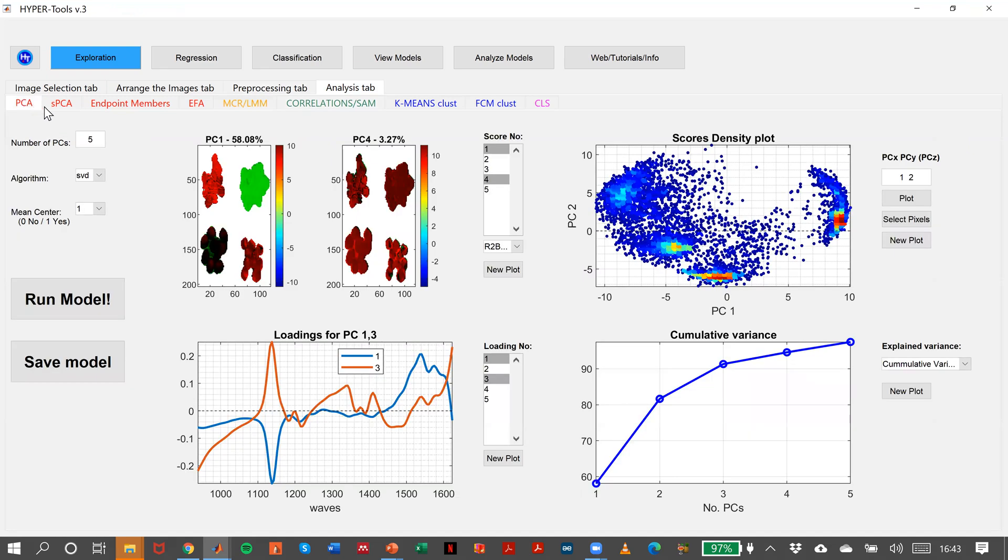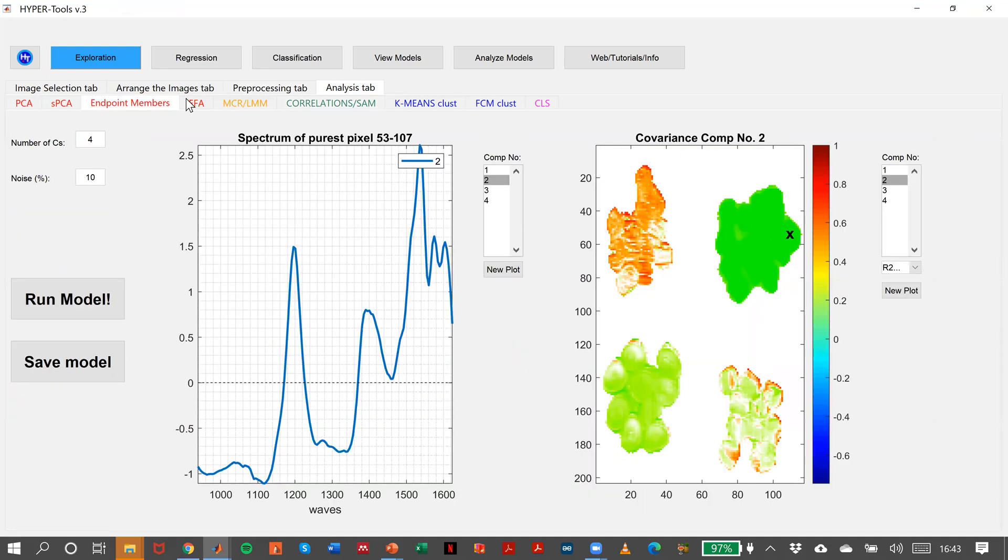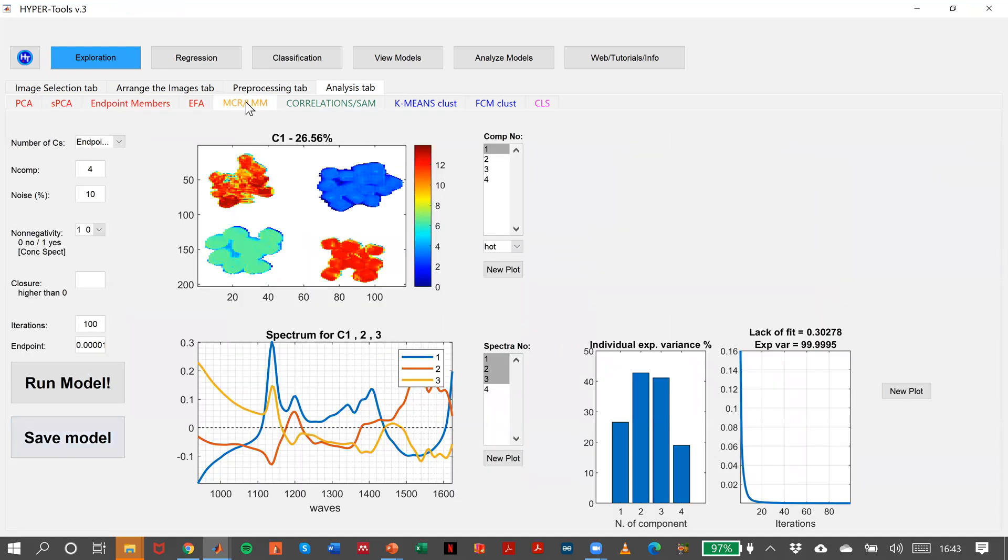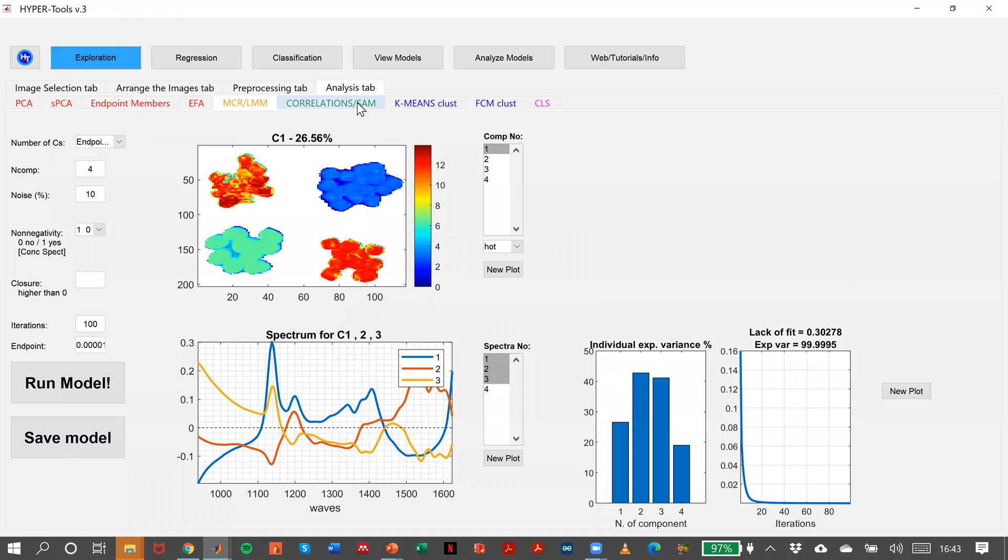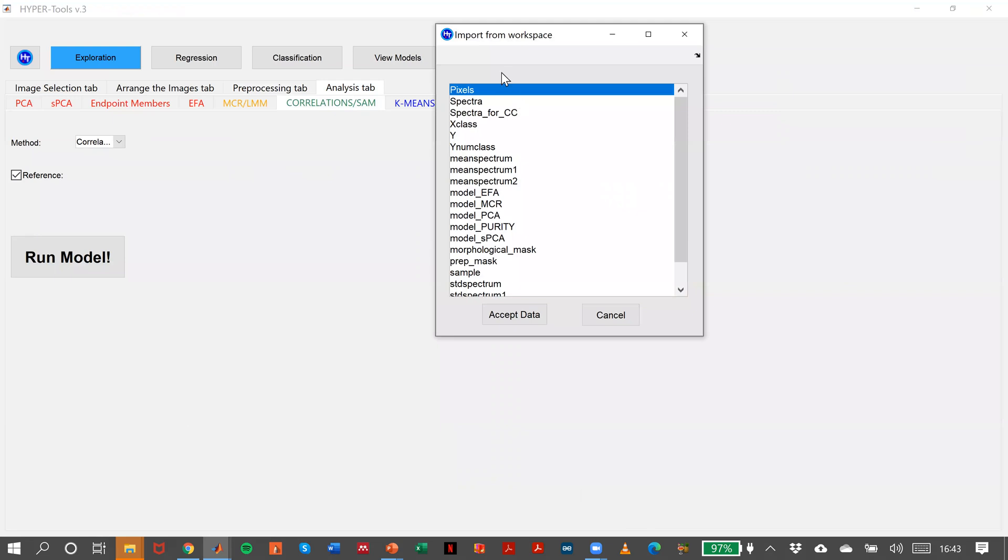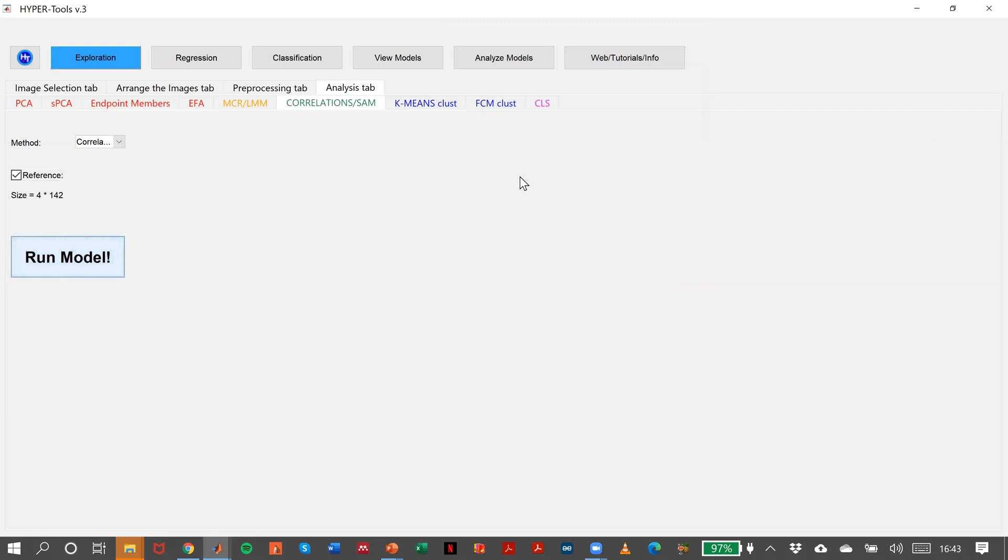Remember that we have all the analysis in here. This is wonderful because we can check whatever we need at any moment. So reference, it will go to the workspace and spectra for CC, accept data, and run the model.